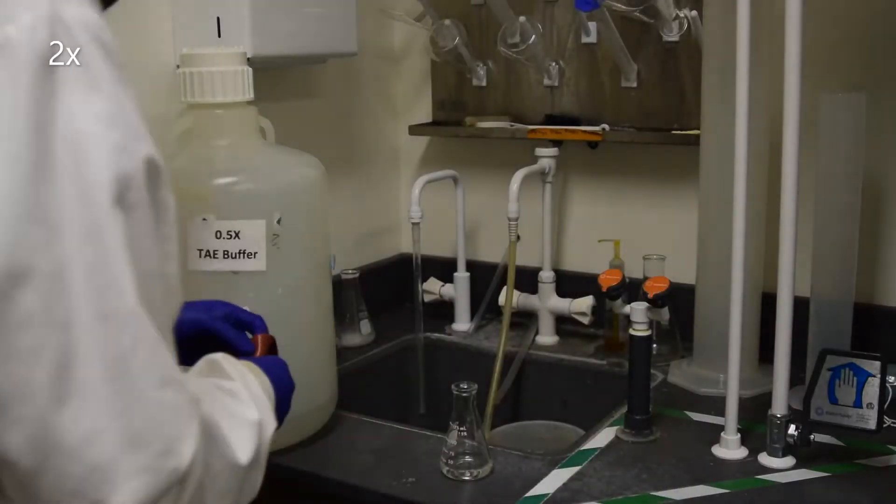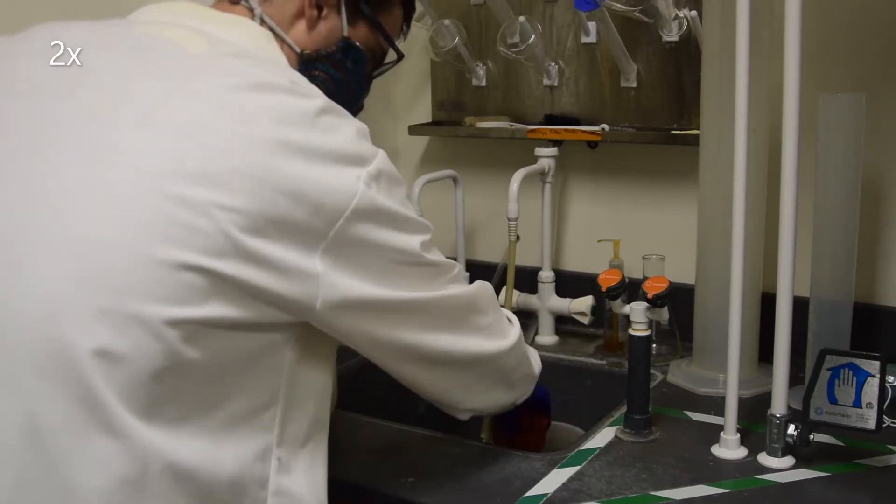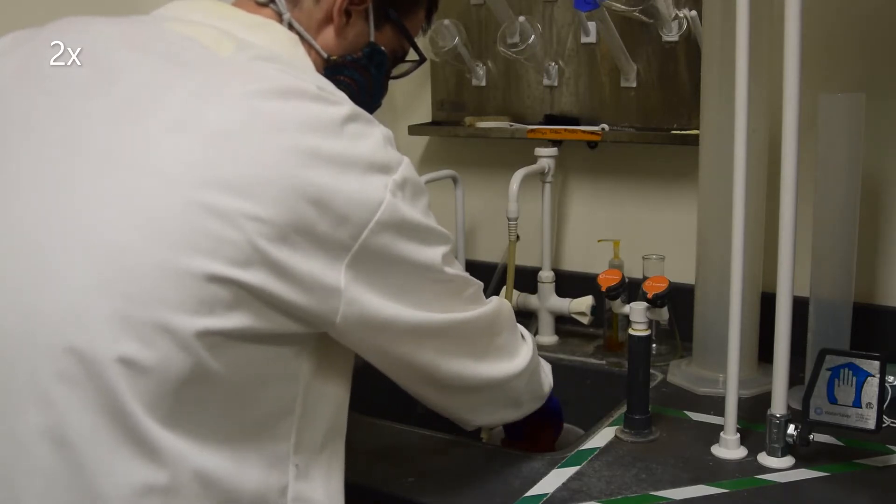Cool the mixture to about 55 degrees Celsius by swirling in a bucket of water. I usually do about 1 second per milliliter. You should be able to hold the flask without it hurting.